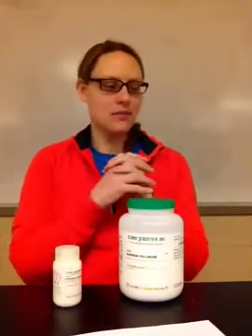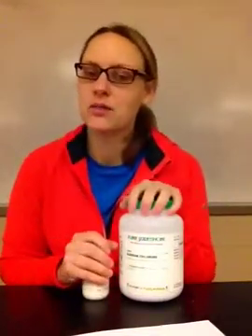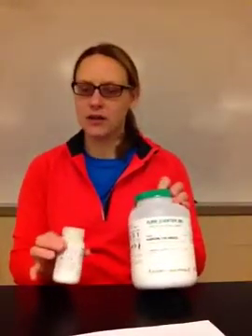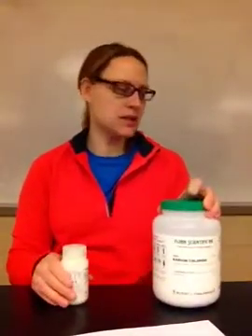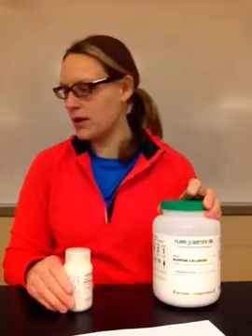And then you are going to filter it, dry it once you get this solid form. So you're going to see what I'm going to be doing. What does it mean? But you want to have these 2 go through a reaction. All right? And if I were to take some, I don't have anything to put them in.